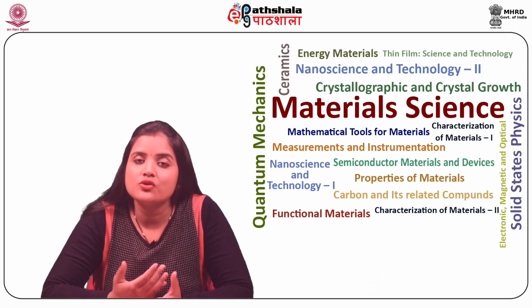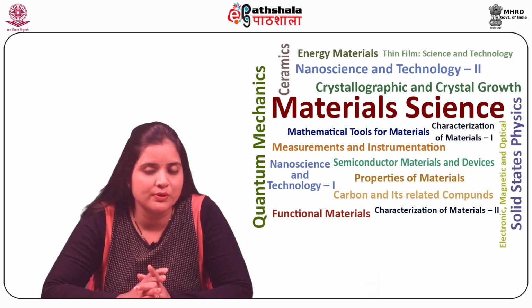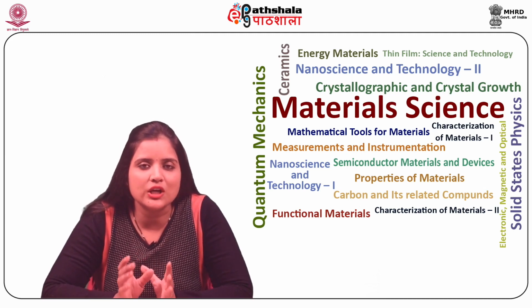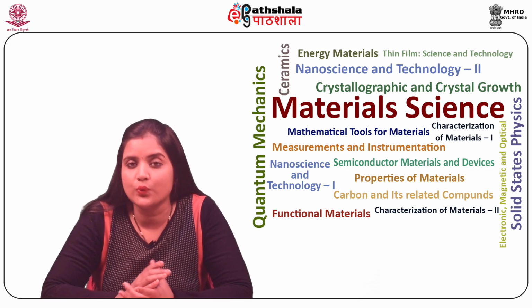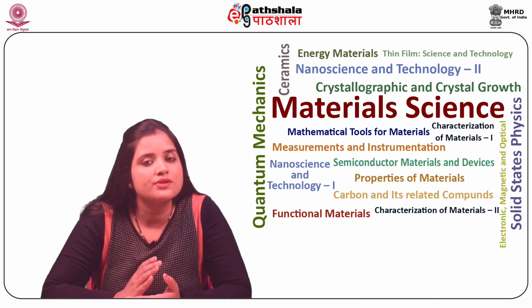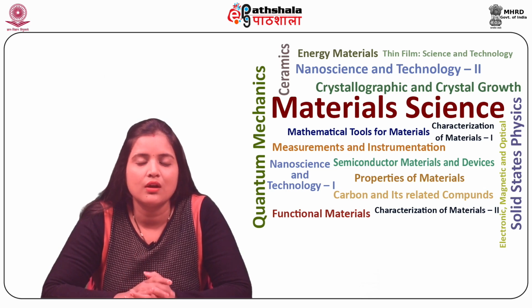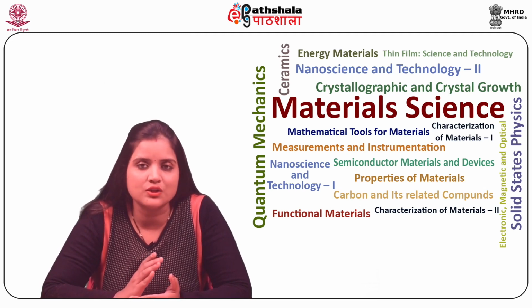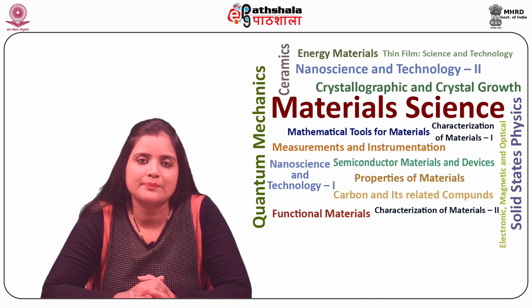Contrast. It is possible to take advantage of the various contrast techniques that are available to optical microscopy through SNOM, but with much higher resolution. By using the change in the polarization of light or the intensity of the light as a function of the incident wavelength, it is possible to make use of contrast enhancing techniques such as staining, fluorescence, phase contrast, and differential interference contrast. It is also possible to provide contrast using the change in refractive index, reflectivity, local stress, and magnetic properties, amongst others.